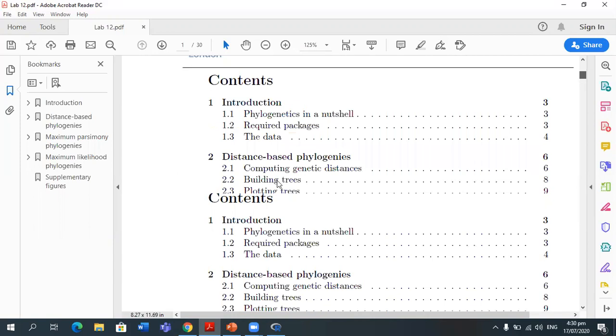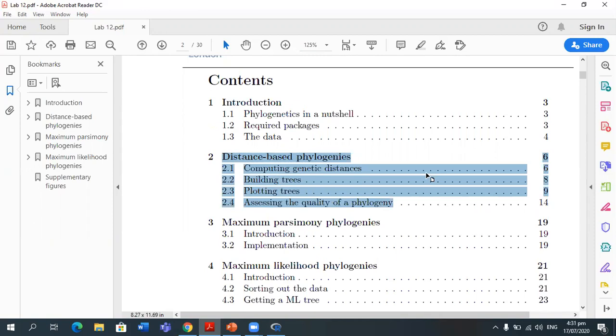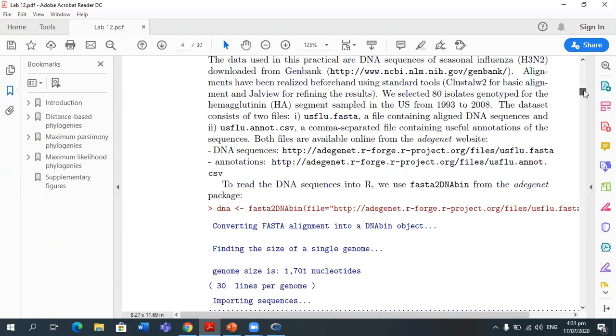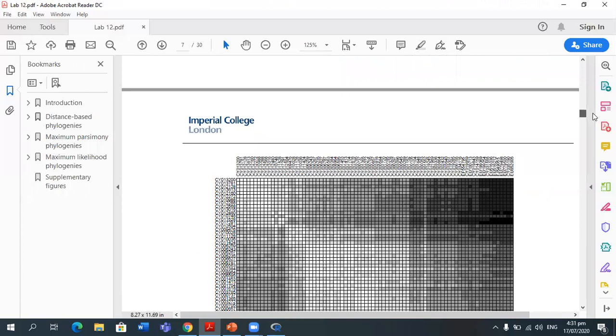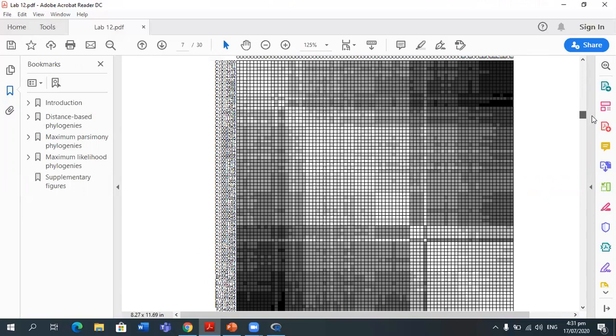Okay, we have just done this step, so we will try to run the commands. There is some given data; you can use it or read it from this URL and practice all these commands, and you can draw very extensive and nice graphs or charts.